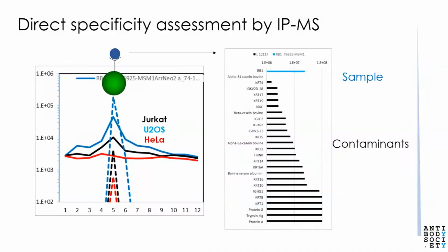We don't use all of the fractions or the entire material for the antibody array analysis. We only use an aliquot of each, so we have material left to work with. Now that we have data from antibody array analysis, we can go back to those fractions and identify fractions that are enriched for the targets of specific antibodies. In this case, an antibody to the retinoblastoma protein bound strongly a protein that eluted in fraction 5 from U2OS cells. So we take this fraction and use it for immunoprecipitation with that antibody.